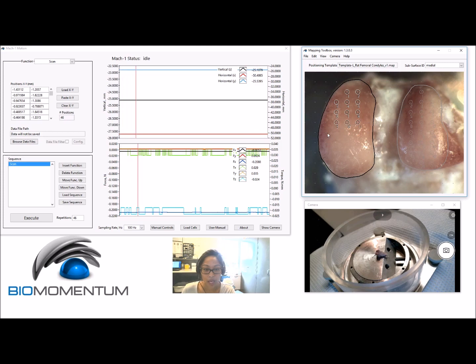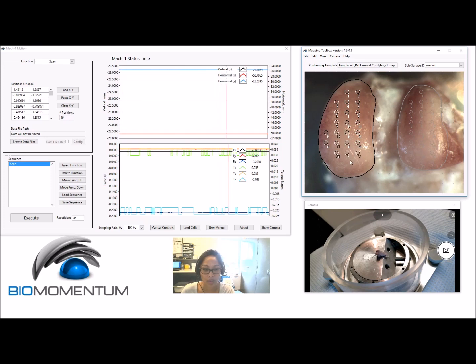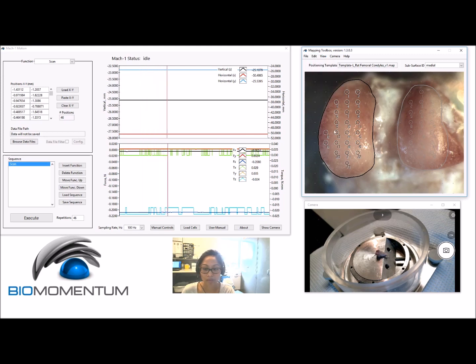Positions could be added one by one according to a snapping grid as shown previously, or anywhere on the sample. Positions could also be imported through a previously created map file.